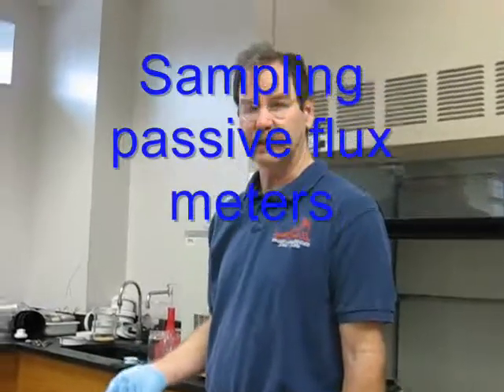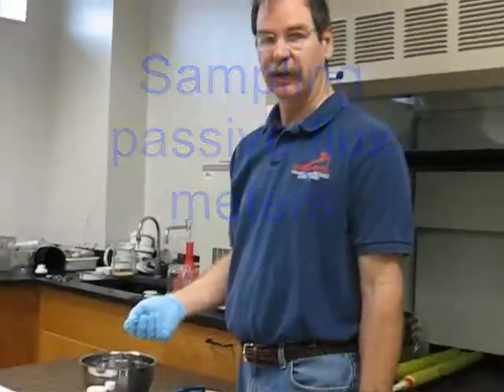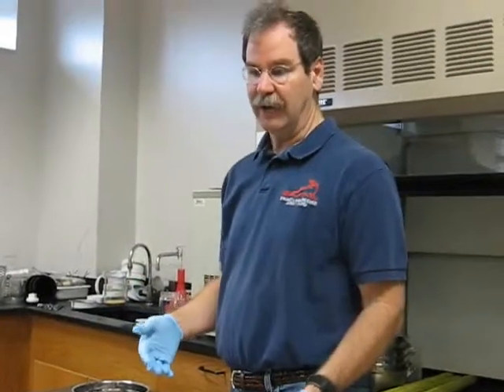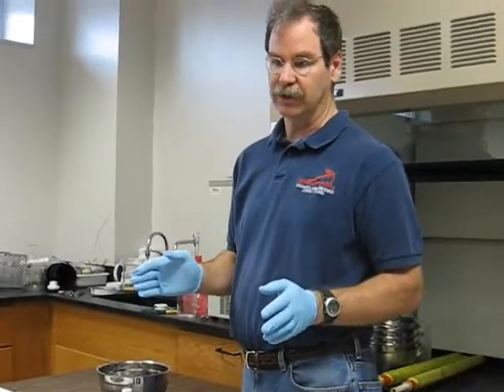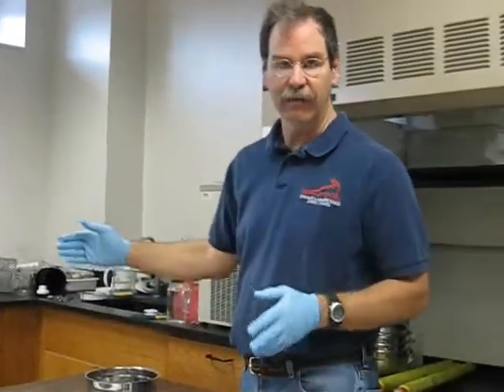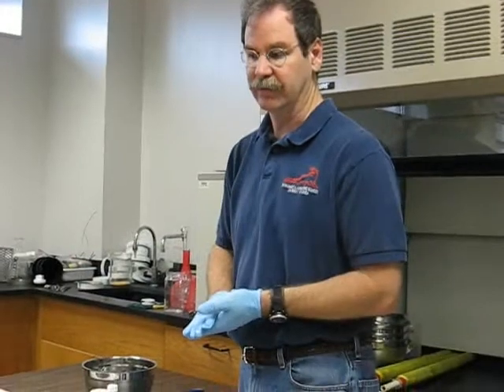We're going to demonstrate sampling of the passive flux meter. We brought it into the lab and we're going to do a demo of sampling one section. Normally you do the same procedure for all four or five sections that you might have in the passive flux meter.